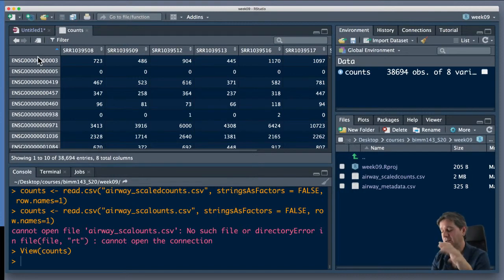They're not HBB or kinesin or cytochromes P450 or something, right? Some names that I would know something about. They're Ensembl identifiers for the Ensembl database. That's the way these authors worked.